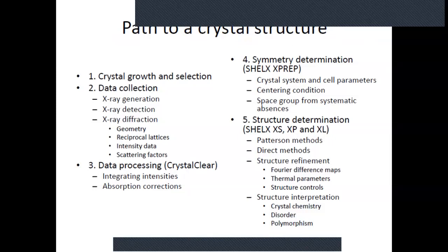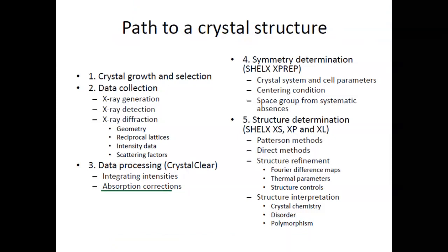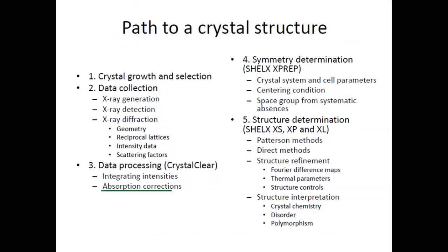So once you collect the data, you have to process it. It's referred to as integrating data. And then we apply different what we call absorption corrections to the data. And this again will be after the midterm, when we start looking at solving crystal structures.